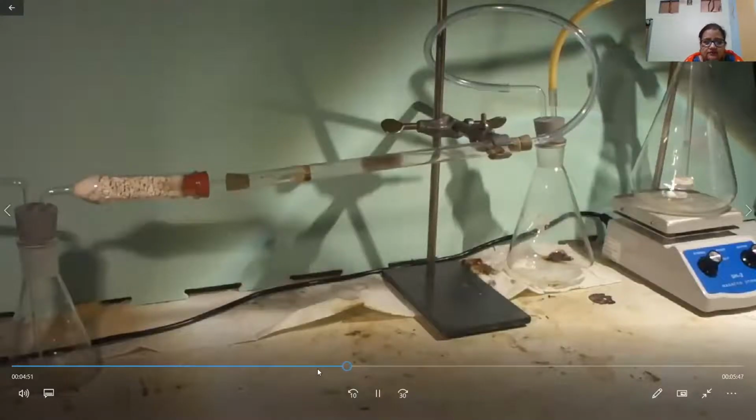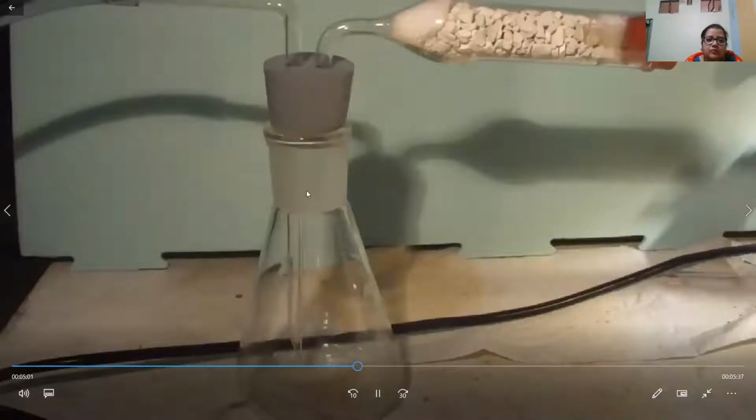On the left, you see the source of ammonia. This is a small Erlenmeyer flask with some 30% ammonia solution. It is stoppered with a 2-hole rubber stopper. The tube on the left leads to a small air pump. The air is then bubbled through the ammonia solution. This results in a mixture of air and ammonia. This mixture is led through a drying tube filled with calcium oxide on the right. This removes any residues of water, as those would cool down the catalyst later on.